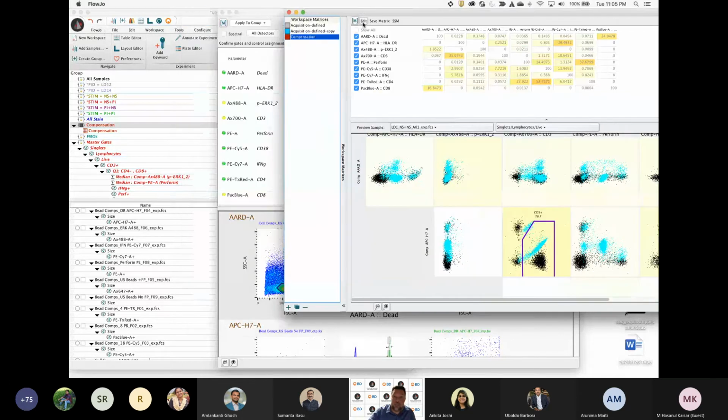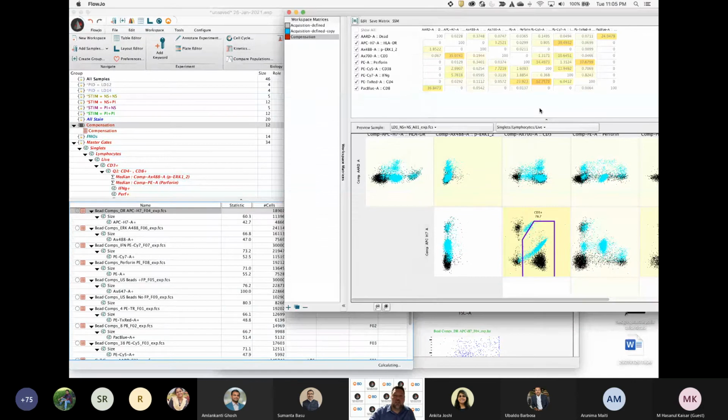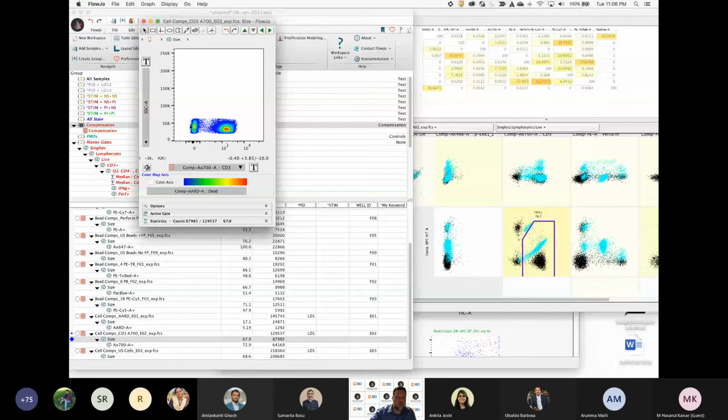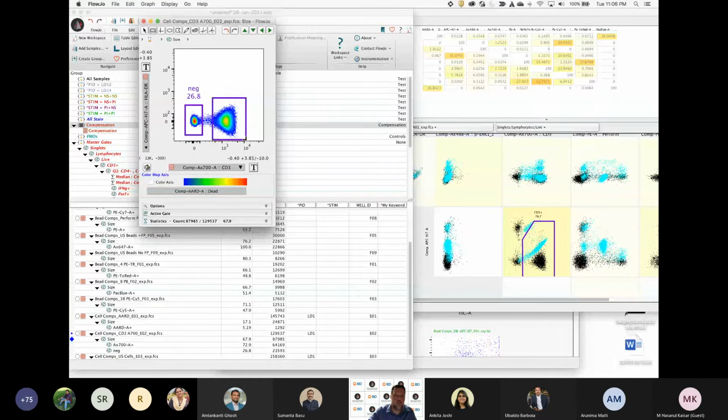I can use either. I'll grab the M button, selecting this compensation matrix, and drag and drop it to my samples, all samples, and now I have these badges turned red, including my compensation. And so when I go back and I want to verify that any interaction is perfectly compensated between one fluorochrome bleeding into a secondary spillover channel, I often like to go back to my comp controls here and do that statistic calculation, which is I'm going to look at my size-gated Alexa 700 stained cells and look at Alexa 700, right? So there's my positive population, my negative population. In the spillover channel, HLA-DR, and what we can do here is gate for neg and positive subsets on the single color comp control.